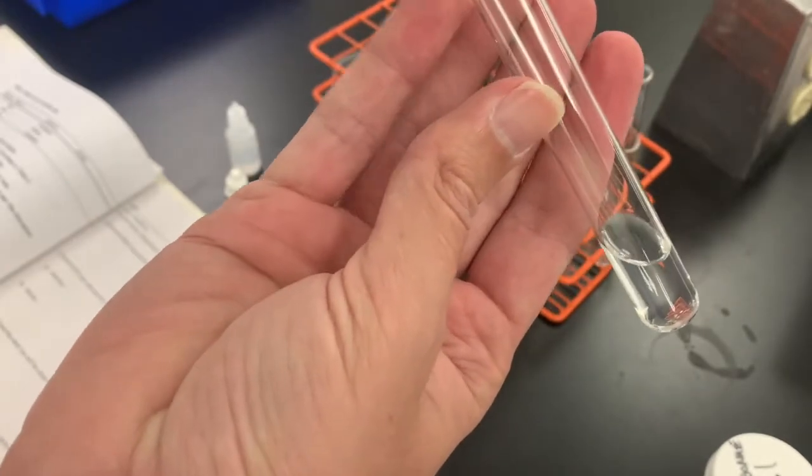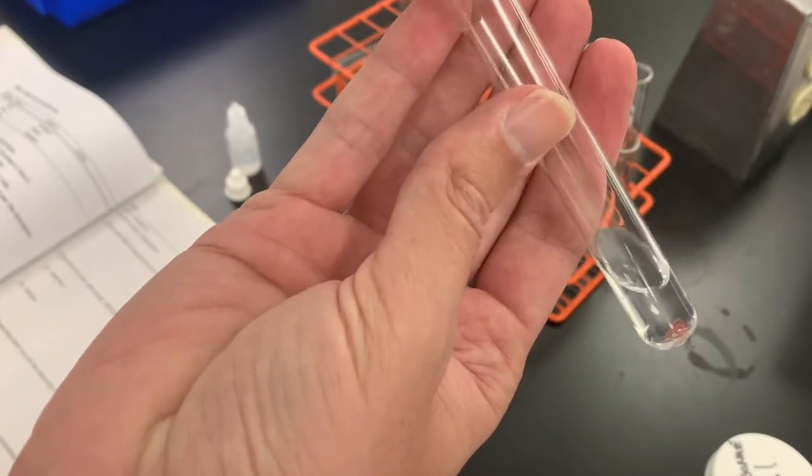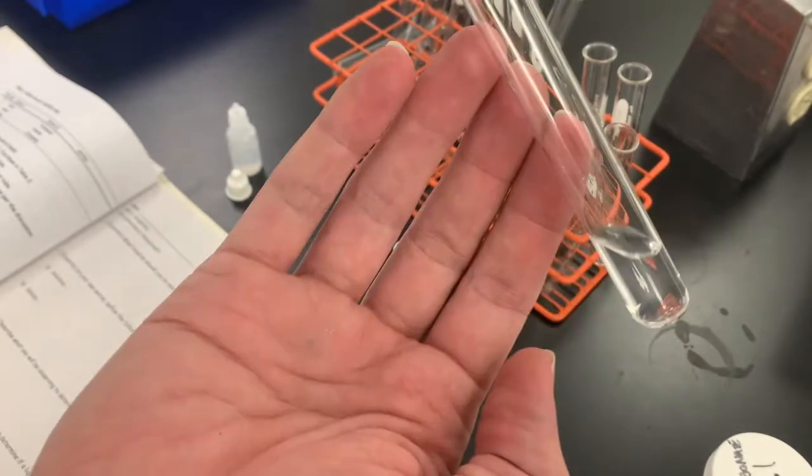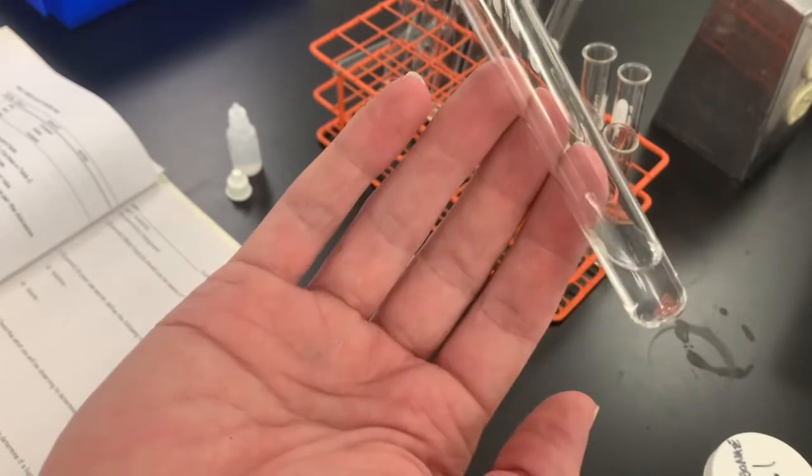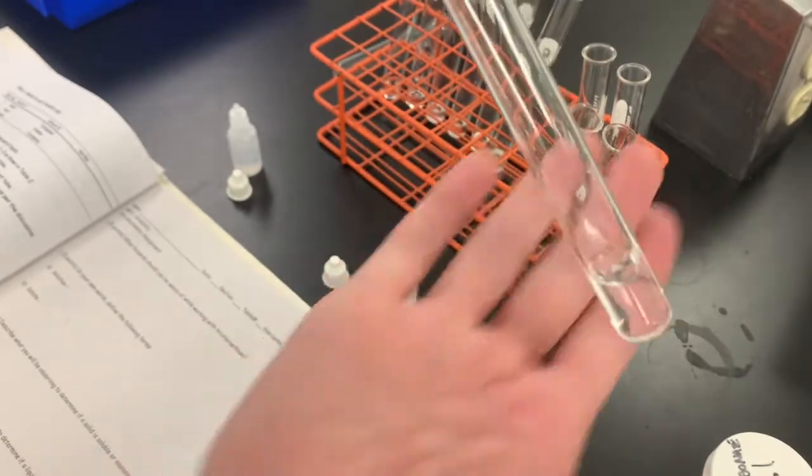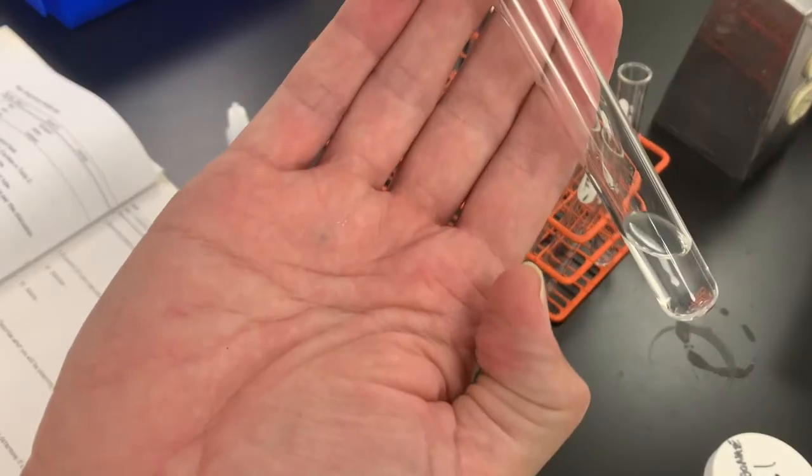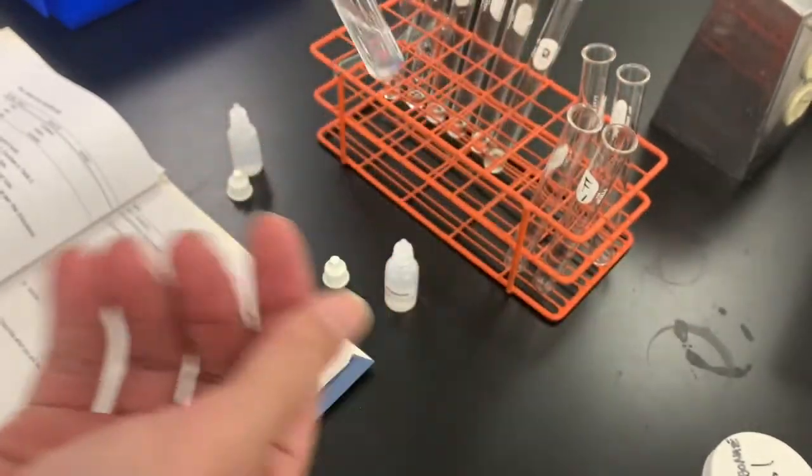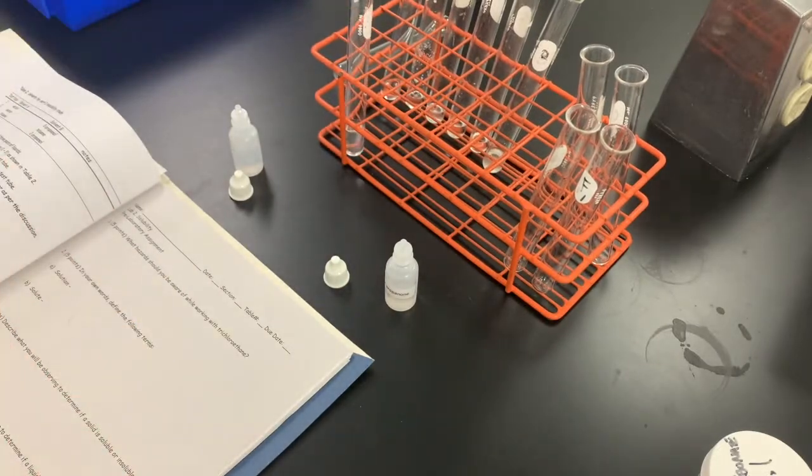And so that's test tube number one of part two. Sometimes, if you have immiscible things like salad dressing or oil and water, you can mix and look for bubbles floating around. There we are, so that's what you can do.